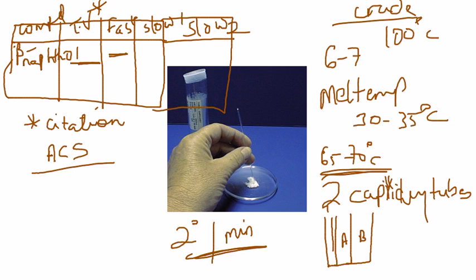Now, I would also recommend that instead of relying on the digitemps, you should actually put the traditional thermometer. That always works better. The digitemp, if it's low on battery or something's odd about it, it's going to give you a weird reading. On the other hand, the traditional thermometer always is more reliable as compared to the digitemp. So if I were you, that is what I would always place in the thermometer holder, which is that cylindrical aluminum spot that you can place your thermometer in. And then carry out your slow reading.